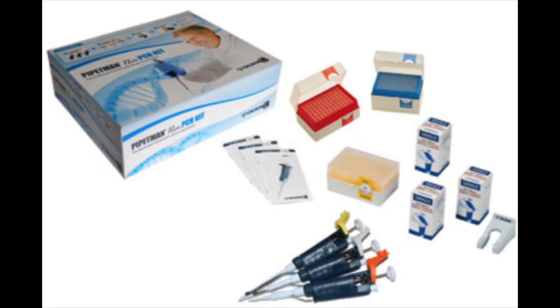Most of the time, an unsuccessful PCR resides in the quality of the sample, which may be affected by the extraction protocol performed, contamination by DNA or salts, among other things. According to Laura Espinosa from the National Institute of Ecology and Climate Change, if you are to perform several PCR reactions, it is highly recommended to use an extraction kit from a reliable vendor. That way, it is mostly guaranteed to have a better outcome.